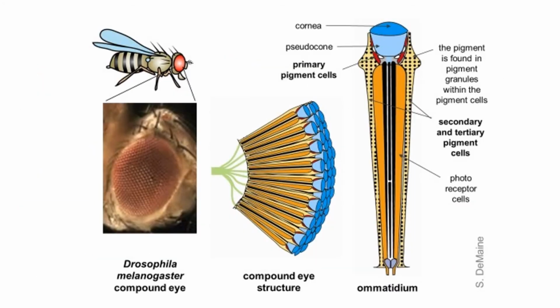So to solve these problems, we are going to use Drosophila, and in your lab manual, they talk about this. Why Drosophila are so good for this: they're very big and very easy to extract the pigment from. So unfortunately, you have to kill these flies, remove the head of the flies, and then crush the eyes to extract the pigment. In the video they describe how to do it, and your lab manual describes it too. There are some differences in the procedure that they ask you.